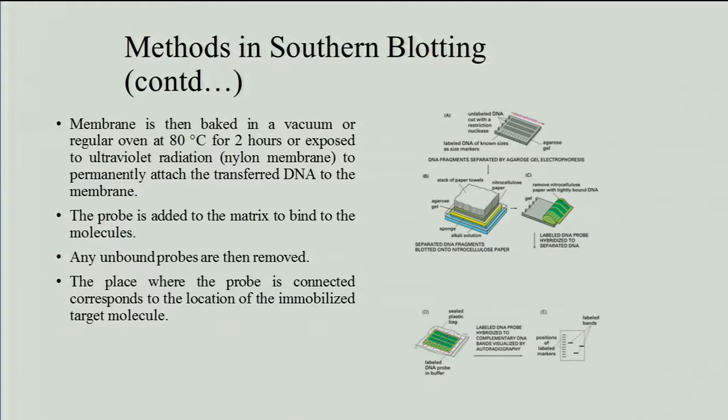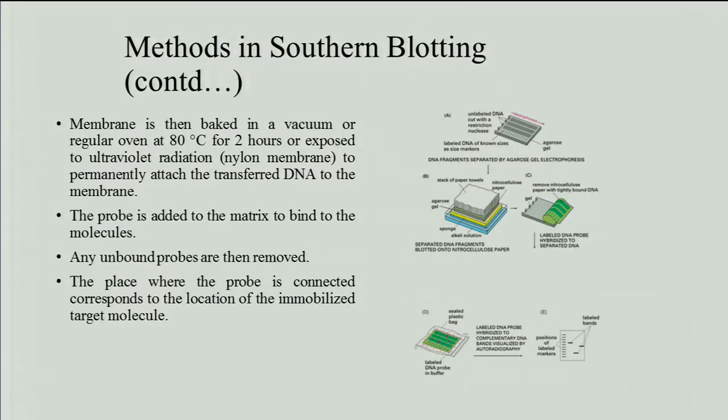So here, calibrating the equipment is known as doing the experiment with a labeled DNA. This is a term which is again used. Labeled DNA means the calibration where we already know what the base pairs are and how long it is. So, with reference to that, you are comparing your results. So, this kind of tells you the process.